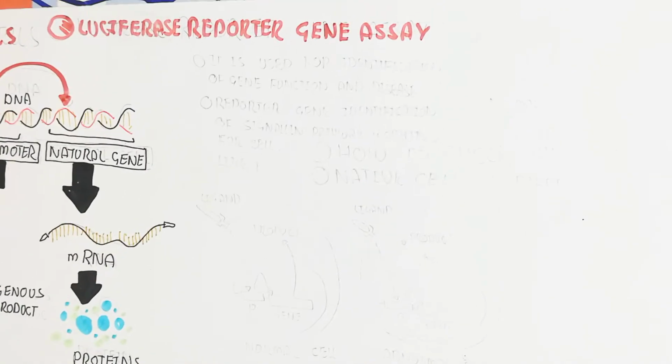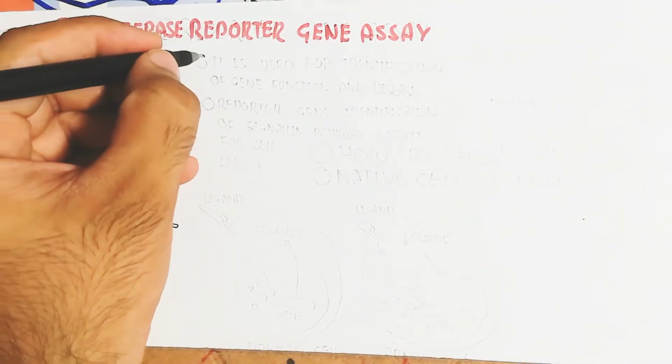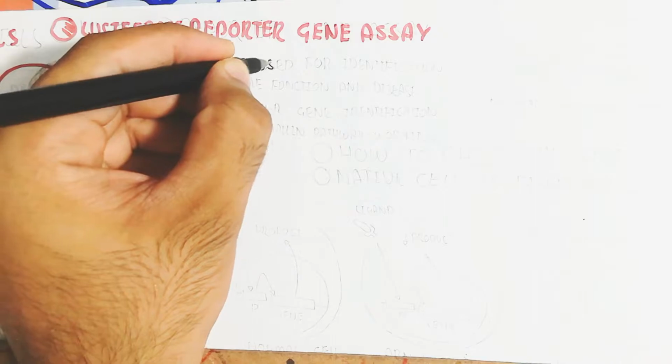So anyhow, let's begin to understand how to check the strength of the promoter.